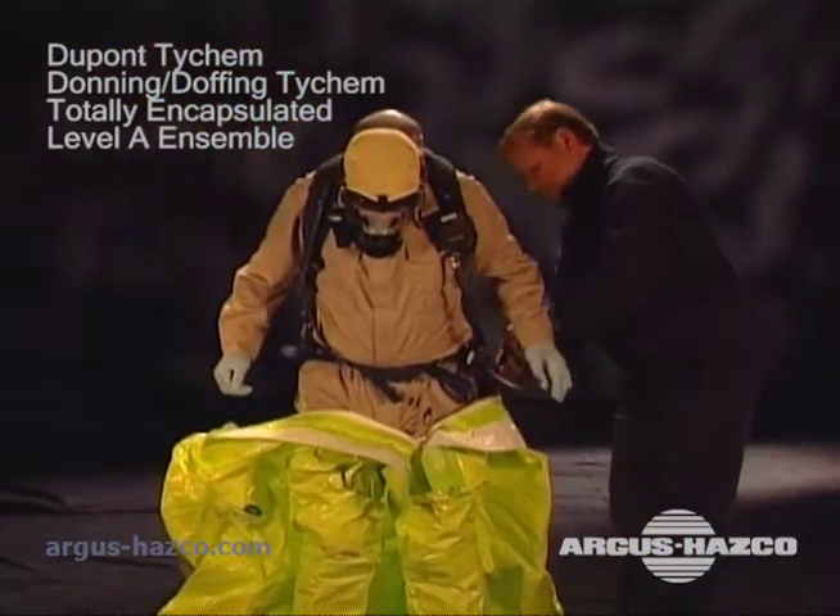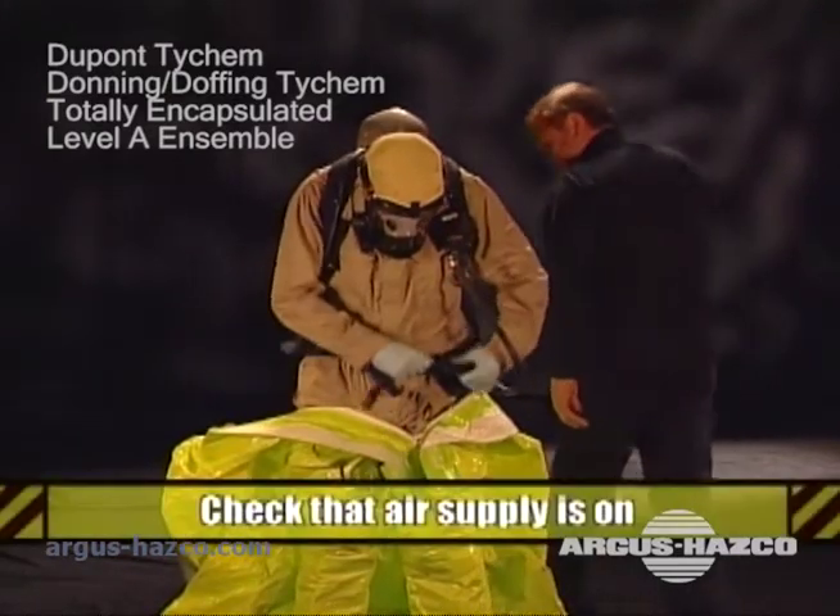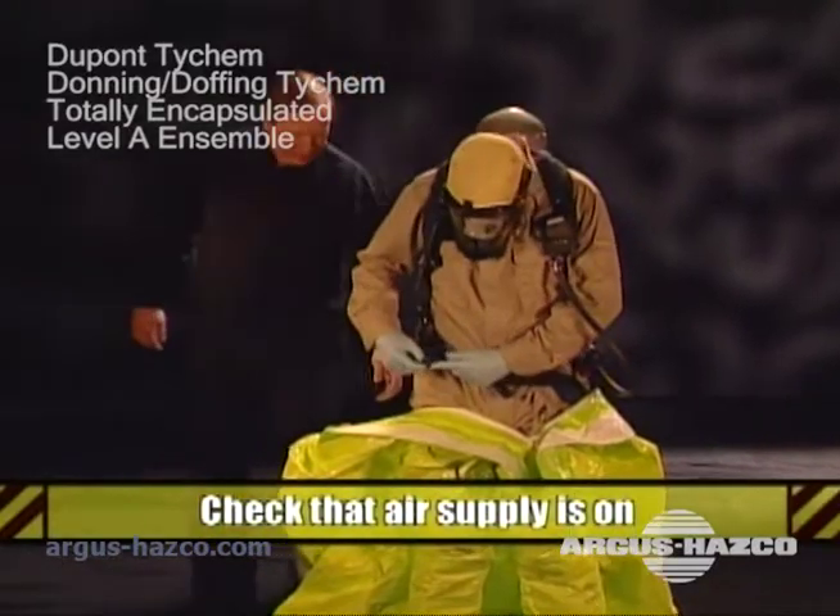Pull the suit up and hook the belt on the inside now. This belt will help support the weight of the suit. This is a good time for the assistant to check that the air supply is turned on.